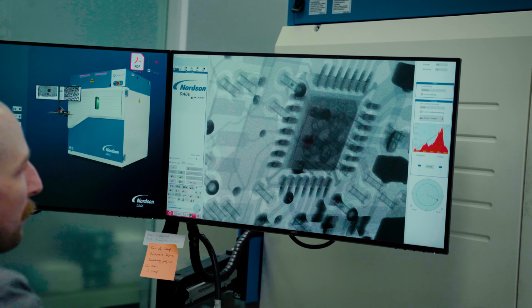Once we had identified the cracking solder joint, we then proceeded with mechanical cross-section of that solder joint so we could get a better look at the crack with optical imaging and scanning electron microscopy. Once we had analyzed the results, we came to the conclusion that the cracking in the solder joint was a result of expedited cooling speeds during the reflow temperature process.